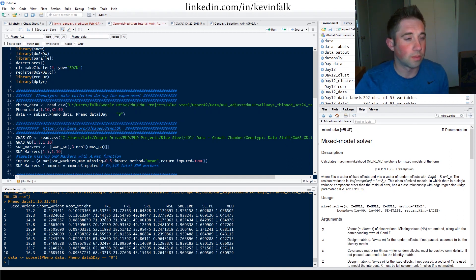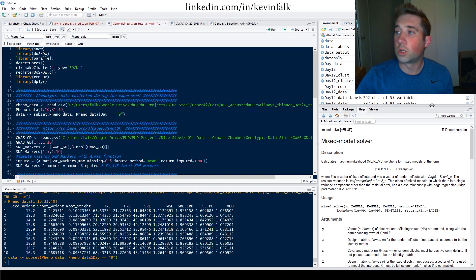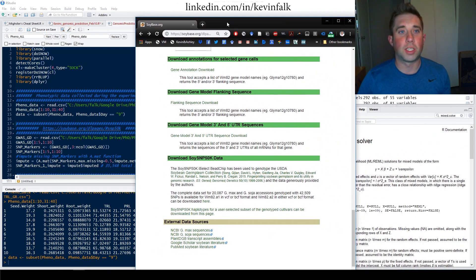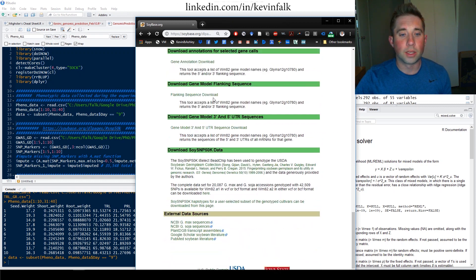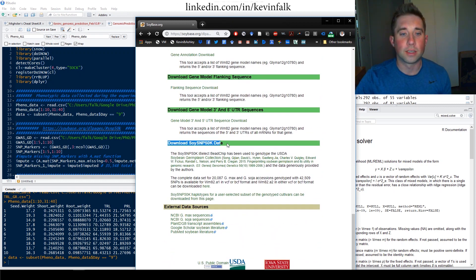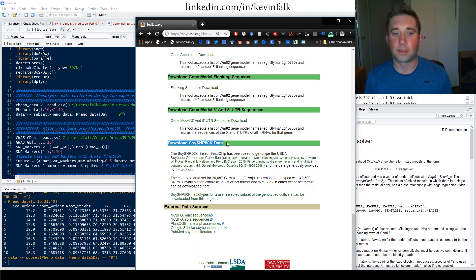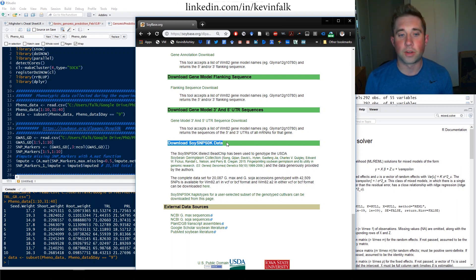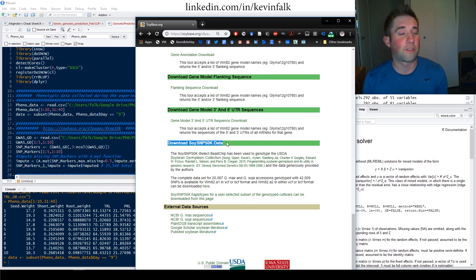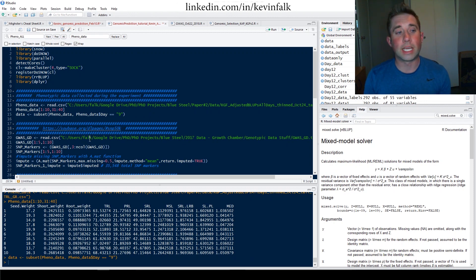For the genotypic data, I got it from the SoyBase.org database, which is free to download. It's run by the USDA and Iowa State University — basically the guys down the hall from where I work. You can go on and download the SoySNP50K data. The USDA has a database of 19,000 genotypes that have been genotyped. You can download the full database, or specify the different accessions or PI numbers you want. I've already done that and entered this data into my system.